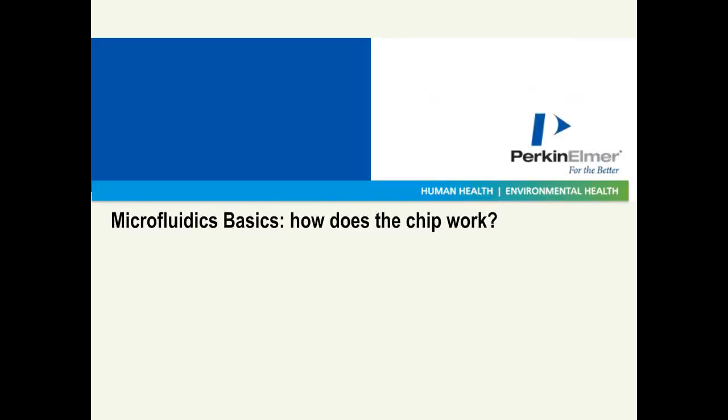You will now see the electrophoresis on the protein chip. This is why you will see an additional step of de-staining. Julius has already mentioned that. And the video is without an audio part, but the descriptions can be read. Tracy, you can start the video.